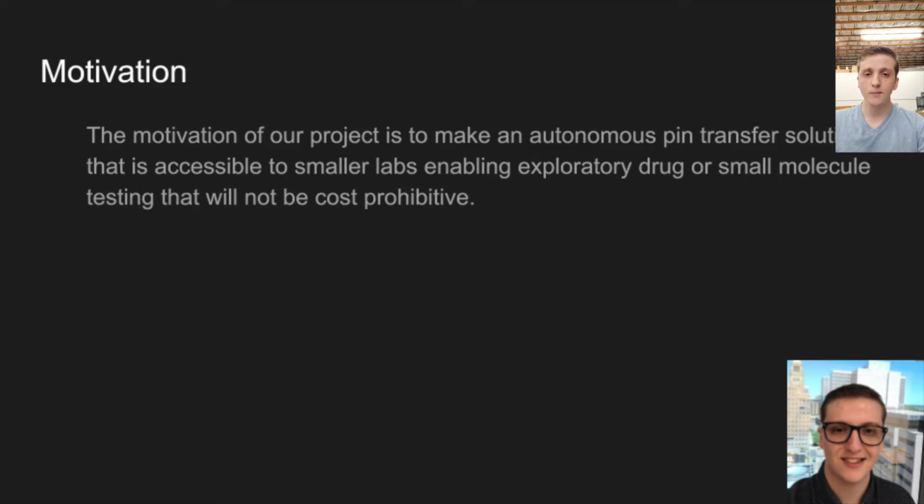So my goal with this project was to make a robot that does what I do, but make it affordable enough so that labs like mine that are dealing with novel diseases, or diseases that affect a small subset of the population and therefore have limited funding, have a way to conduct these kinds of chemical screens that don't require access to some of the larger labs, like at the NIH, that are extremely expensive with huge robotics that just aren't accessible to these kinds of biology labs.